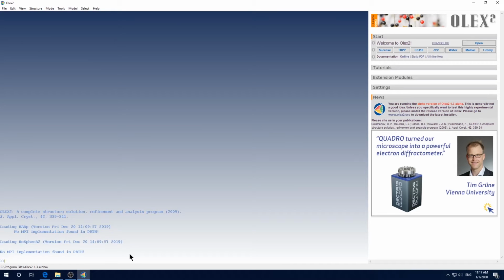In the last video, I showed you how to install Olex2 from scratch and some basic settings. Now, I want to show you how to use Olex2 to solve and refine your first crystal structure. If you haven't installed Olex2 yet, please watch my previous video for the installation guide. I will put a link down below for you.